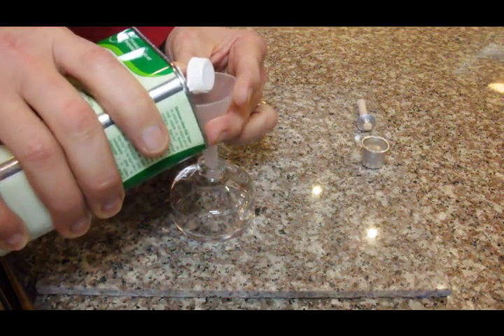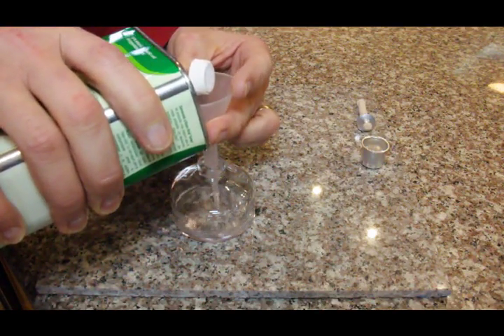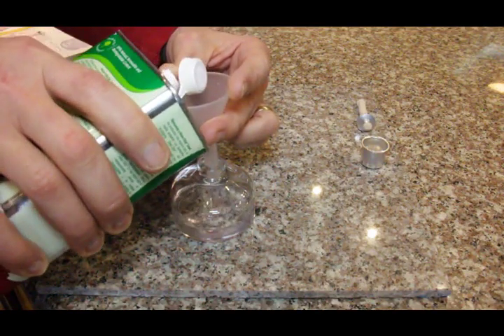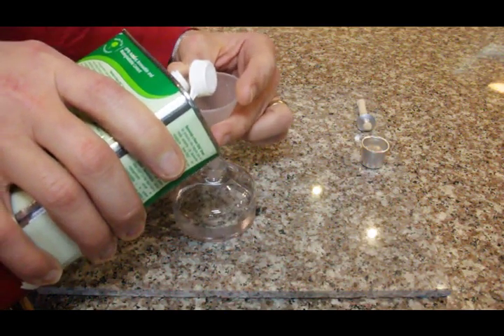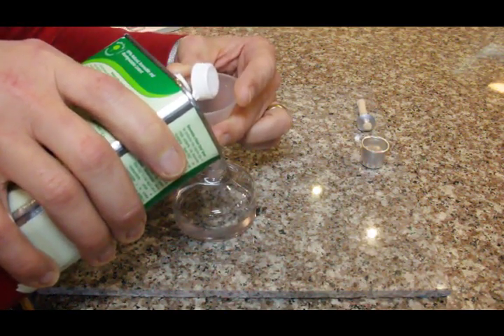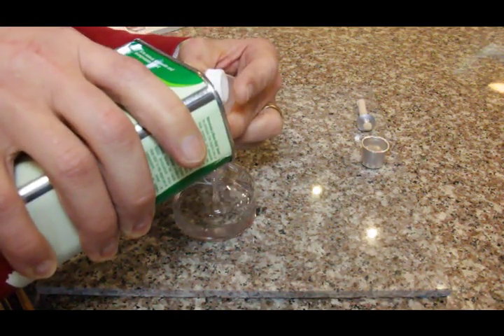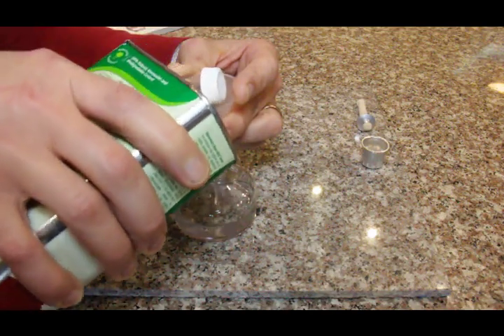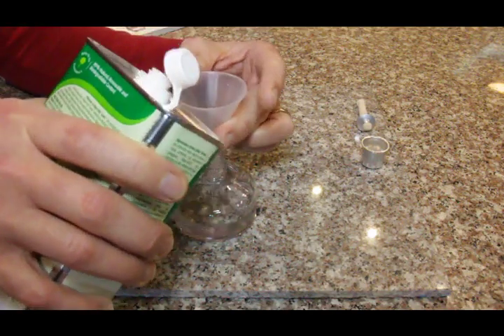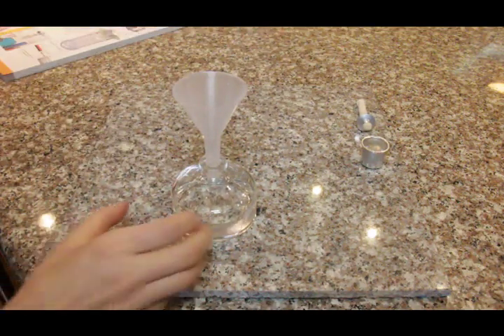You need to be sure to observe the maximum fill line so you do not fill too full. Turn the bottle around. Is it right there? Is it that line? Yes.